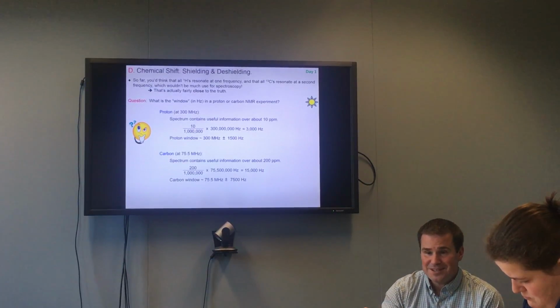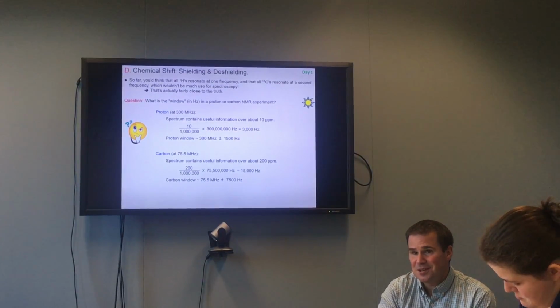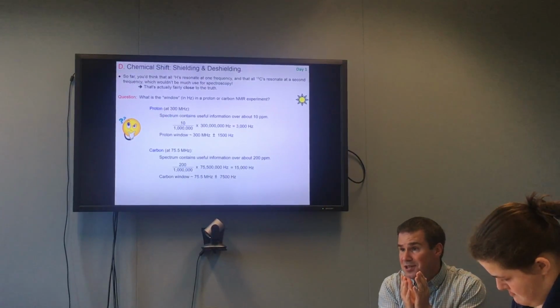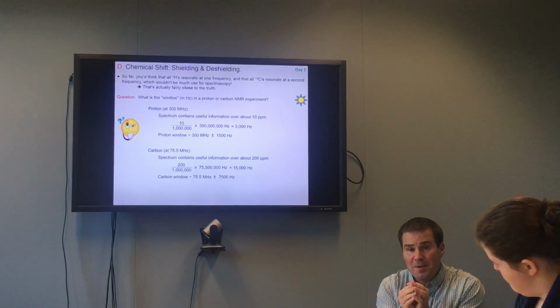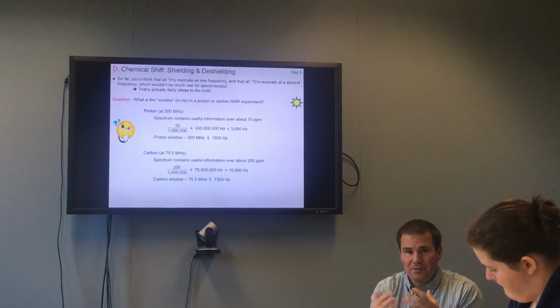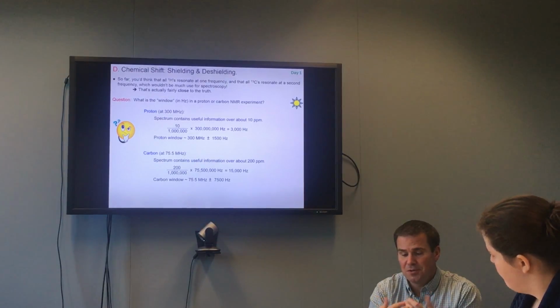And again, it's amazing that NMR actually works as a useful technique when you think how tight all your electronics need to be in order for that experiment to work, how much control you need to have over the entire process. I think that is really remarkable.